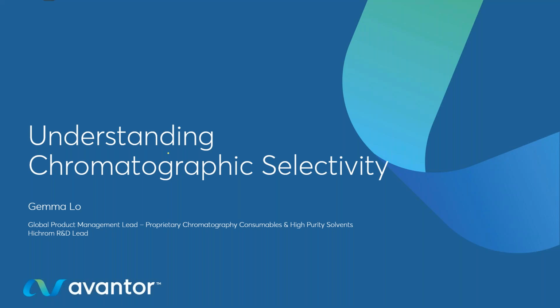As Alex mentioned, we're going to be talking about chromatographic selectivity, and this is part of 3 sessions we're going to run over the coming weeks. So today we're going to look at why selectivity is important, specifically in reverse phase chromatography from both a theoretical and a practical point of view. We're going to have one very brief look at the end at method development workflows, but more of that to come in subsequent sessions.